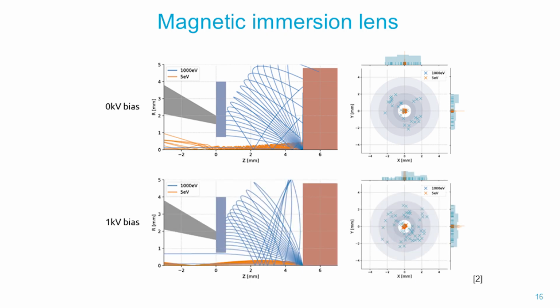Now in the lower situations you see the combined effect of the electrostatic immersion with the magnetic field immersion, and now you see the secondaries again are accelerated, so they don't circle towards the optical axis that much anymore, and they make 1 or 2 orbits towards the axis and then they go into the column. And also for the backscatters, now we see that more backscatters actually hit the detector and less are deflected downward. And so I think this is a nice illustration of how the electromagnetic forces, the Coulomb force and the Lorentz force, also act on moving electrons.